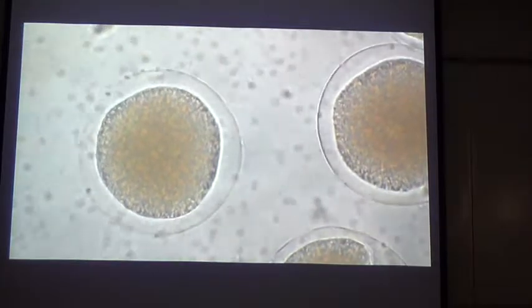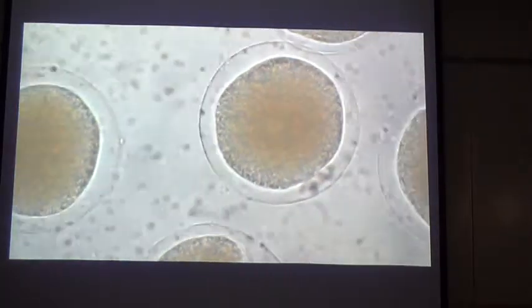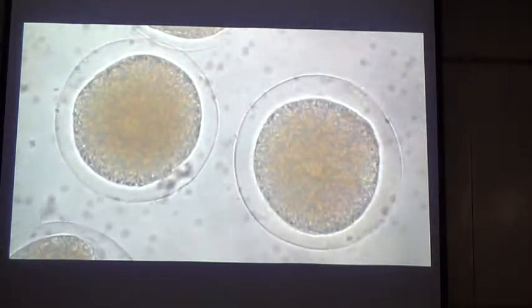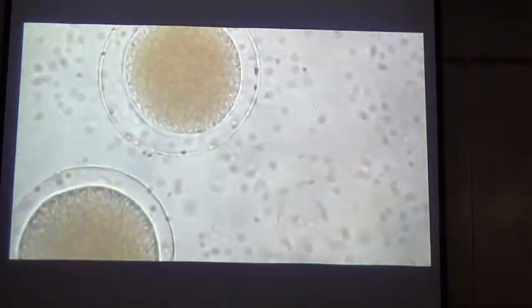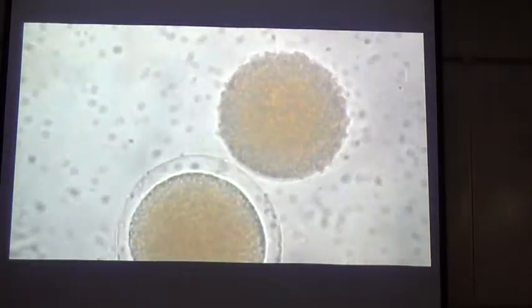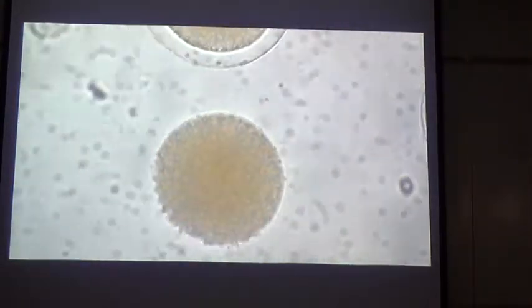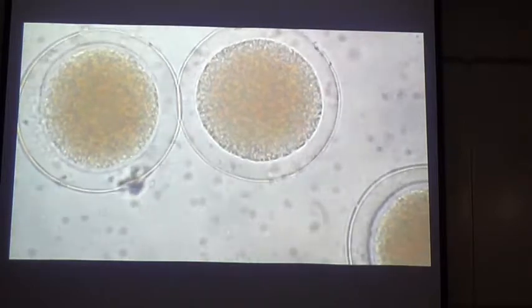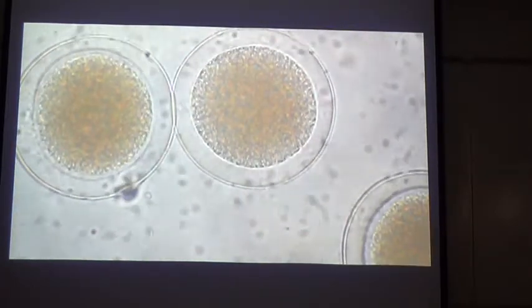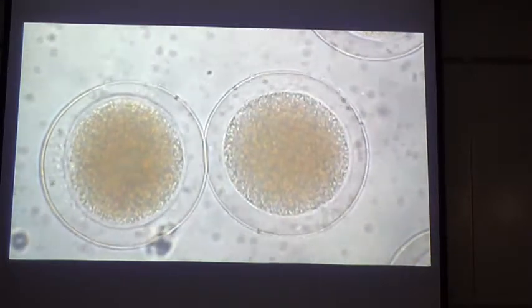So all of these eggs have now been fertilized. I wanted you to know, I've sometimes asked on a lab exam, which of these is this egg fertilized or not fertilized? If it has that fertilization membrane separated like that, due to the cortical reaction, the egg has been fertilized. So where's the one sperm that got in? It could be on the back side. It's hard to say where it might be. You can see there's still a bunch that are stuck. So they get stuck in the little... Yeah. Is it hardened? They'll get stuck in there. So they're still working on this one. So all of these have been fertilized. That's what you're supposed to see today in your microscope.